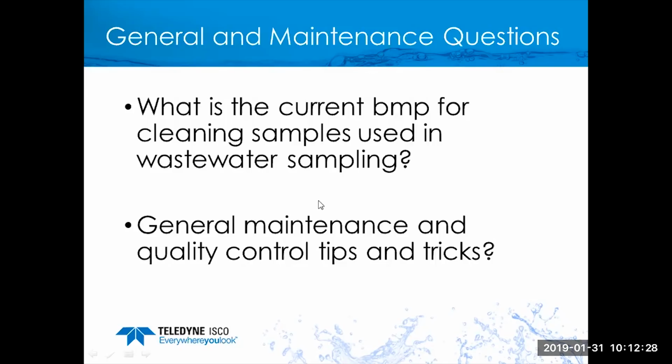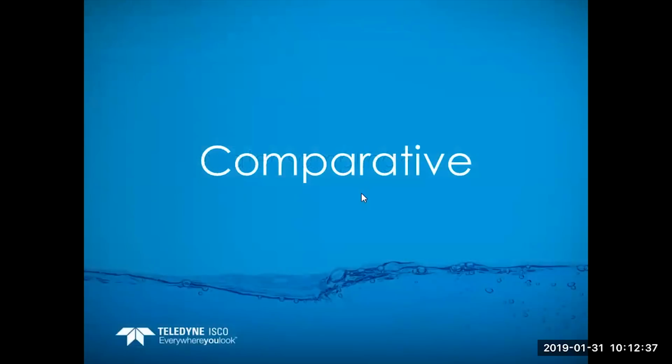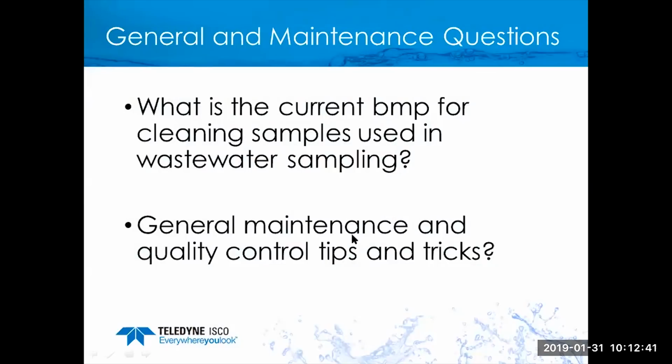The other thing that's important, especially if you have an application that is more remote and more prolonged in its duration of deployment: do we have good battery charge? Are batteries going to be able to carry us through and deliver the sample that we expect? There are a couple of other questions here that have come in.